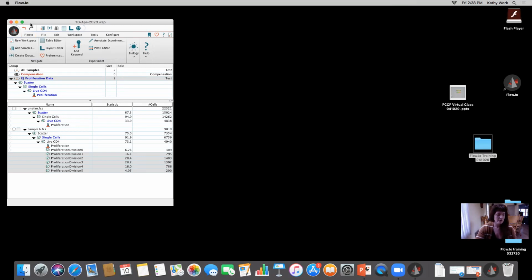I've tried working with those before. They could be a little bit tricky to work with. I don't know if it's just in my hands because it's been a little while since I've been on the bench. I stain samples and everything like that only intermittently.